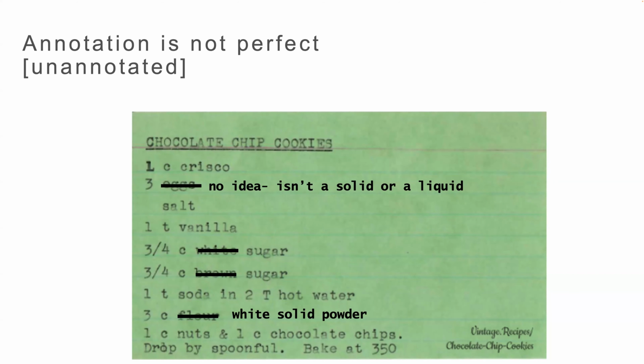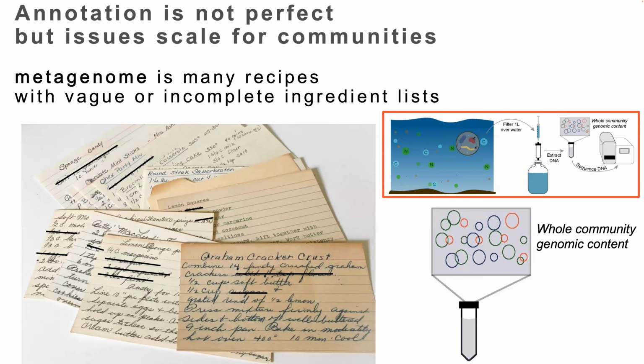And so this is something we think about when we're talking about metagenomes, because this problem just becomes compounded and compounded. I'm hoping to show you today how we can overcome some of these barriers with DRAM, and also the idea that DRAM is a living annotation pipeline. For people working on specific pathways, or who curate a gene set that maybe isn't in KEGG, we have ways in DRAM to adapt that so you can do your annotations at a higher level than what the databases represent, because the databases are slow in catching up to all the science that we're all pushing out.